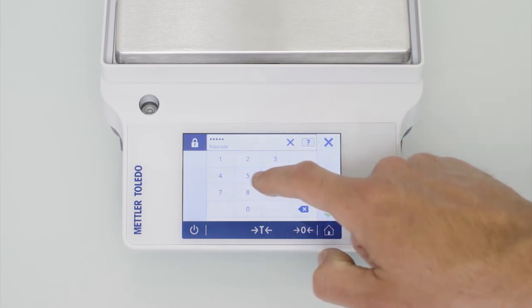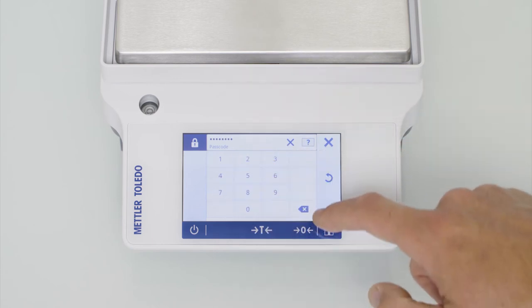The MET stands for built-in ease and security with sample IDs and passcode protection. Enter a code before changing the settings of the balance to make sure settings are not changed by unauthorized personnel.